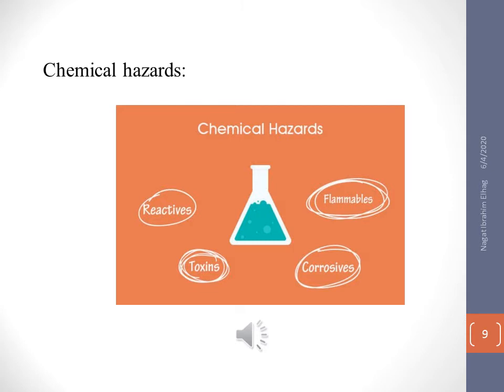and your body. Also, reactive: some reagents or some solutions inside the lab, from time to time you deal with them. They have the ability to react, so you have to be careful to handle these reagents, not to put a wrong solution into another, to make hazards, to make something go wrong inside your lab.